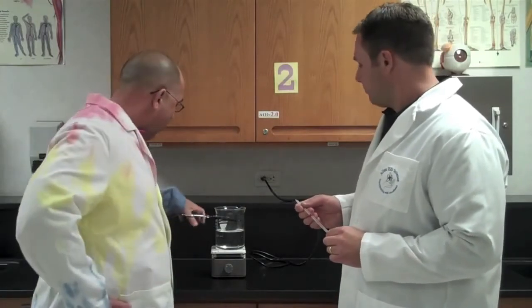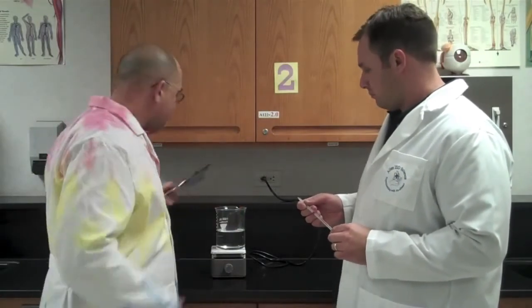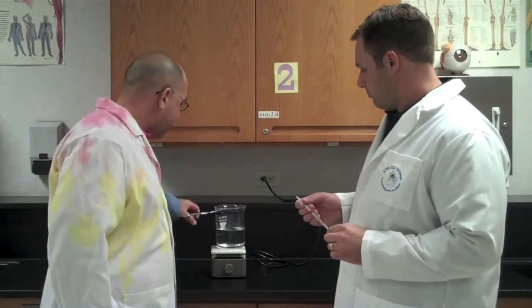And then if this was boiling and I was going to remove this, I'd be using these beaker tongs. And I would grab the beaker tongs. See, there's rubber coating here so it doesn't slip off. It grabs this and I can move this beaker off and onto the hot plate. This is a hot plate. Anyway, it's not boiling.